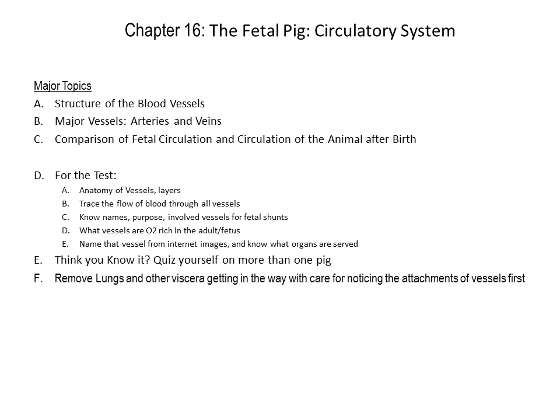And I already warned you to take a look at lots of internet images, take a look at different pigs in the lab, and see if you can identify the same structures. Again, that's listed there. And as a practical matter, when you're dissecting today, you can take the lungs out pretty handily to start getting a look at the back end of the heart. I think it's going to be important to keep that intact so that you can see the foramen ovale, not the ductus venosus, but the ductus arteriosus. Those are the fetal structures.